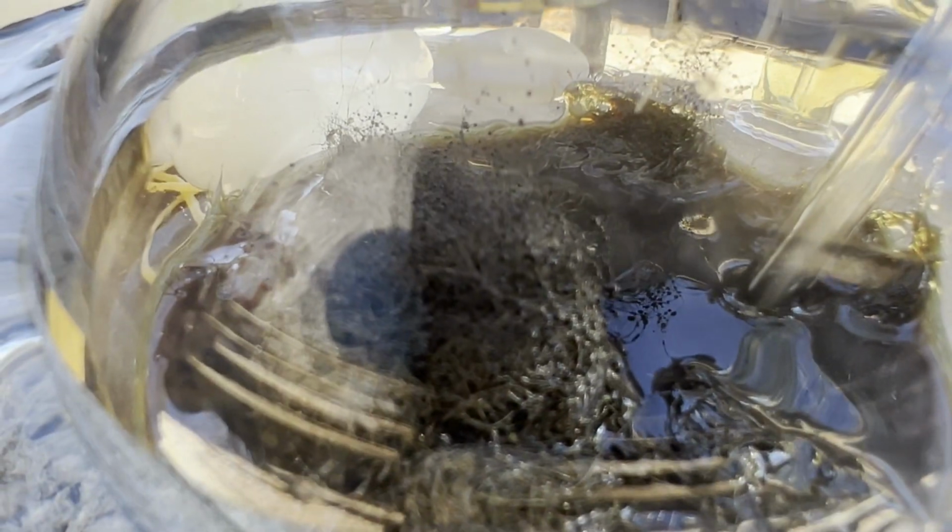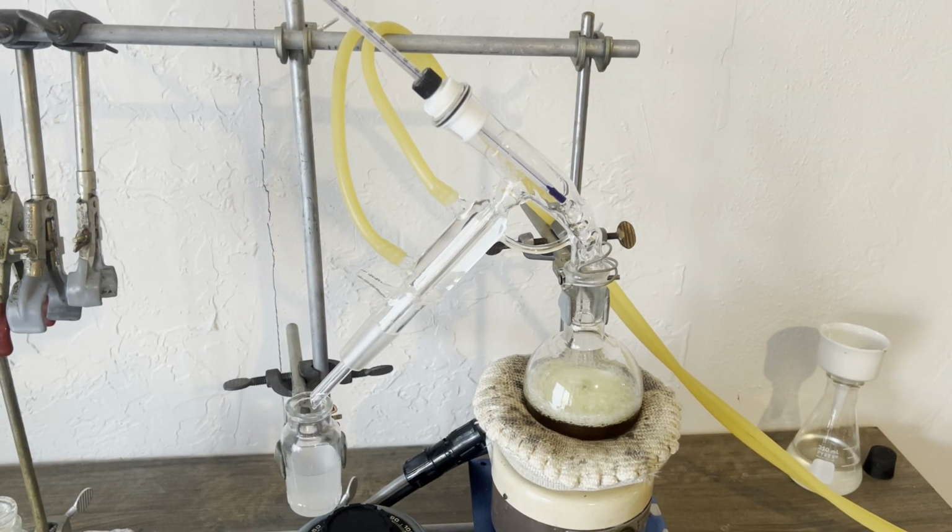So I temporarily took the flask out of the ice bath to sort of jumpstart the reaction. I think the iron-sulfur catalyst isn't as active as the typical Lewis acid catalysts like ferric chloride or aluminum chloride, so I found the jump starting fairly helpful.